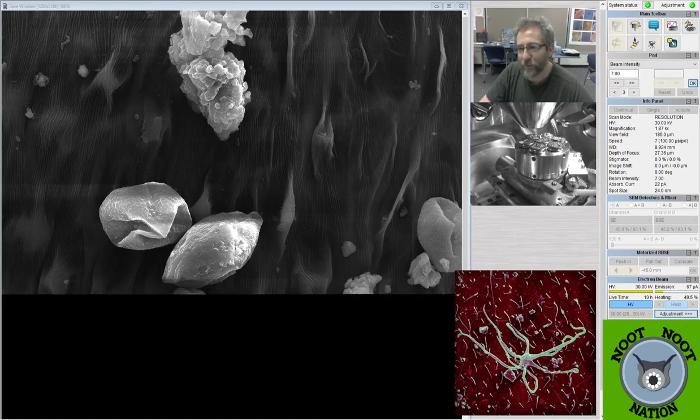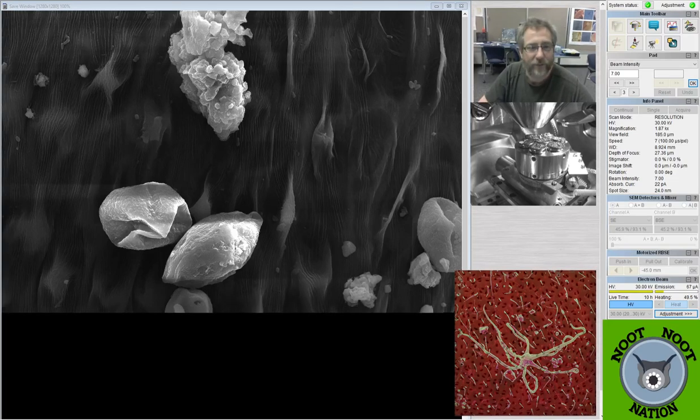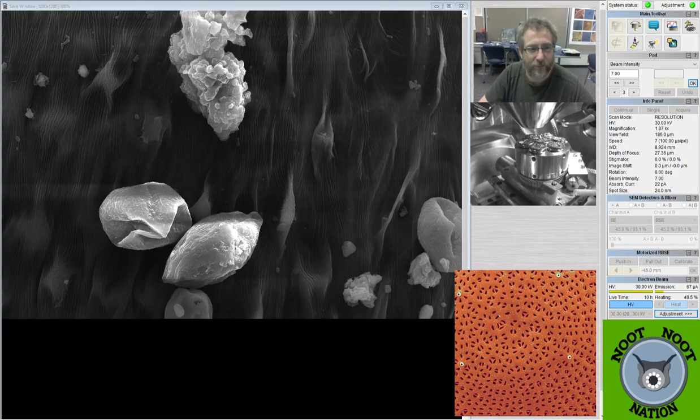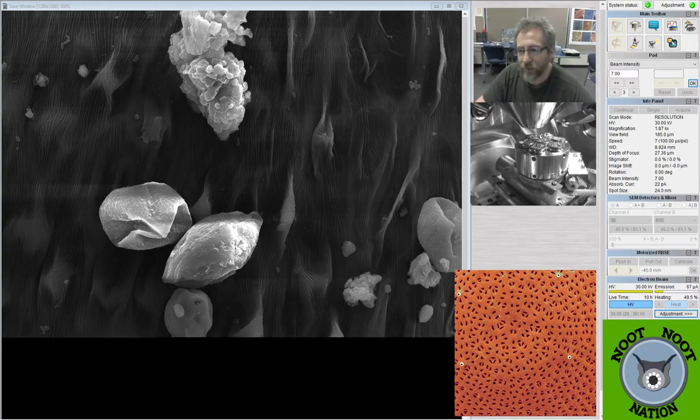Yeah, this is sort of a fun way to teach. We're looking at pollen today, Dell. It's samples that I collected from just wandering around campus and my yard and everything else.